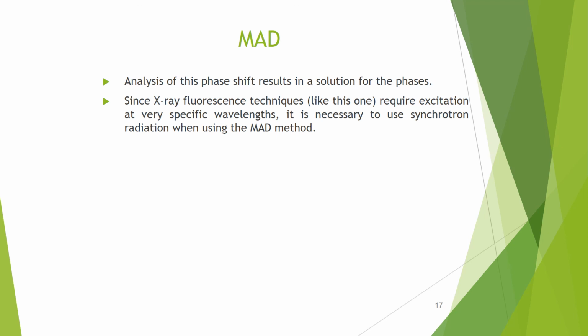We have studied it in the previous slide. Analysis of these phase shifts results in a solution for the phases. Since X-ray fluorescence techniques like this one require excitation at a very specific wavelength, it is necessary to use synchrotron radiation when using the MAD method.